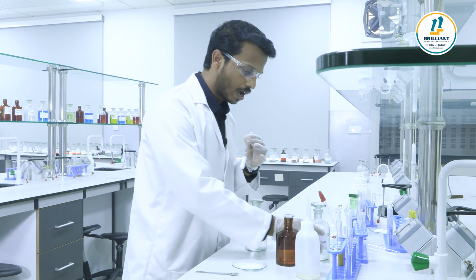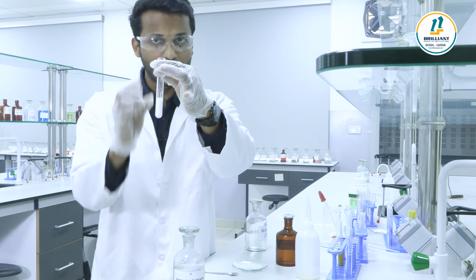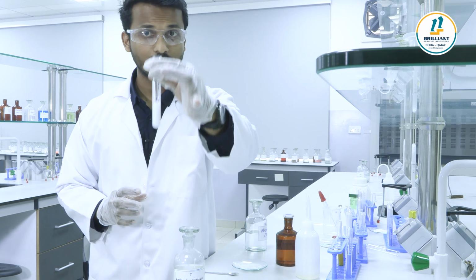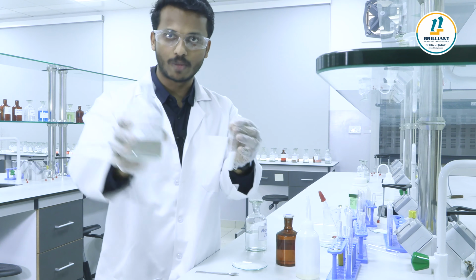So let me take ammonium hydroxide solution. Okay, what all things did we add here? To the salt solution we added dilute nitric acid, to which we added silver nitrate. We got a white curdy precipitate which is soluble in ammonium hydroxide. So let me take ammonium hydroxide.